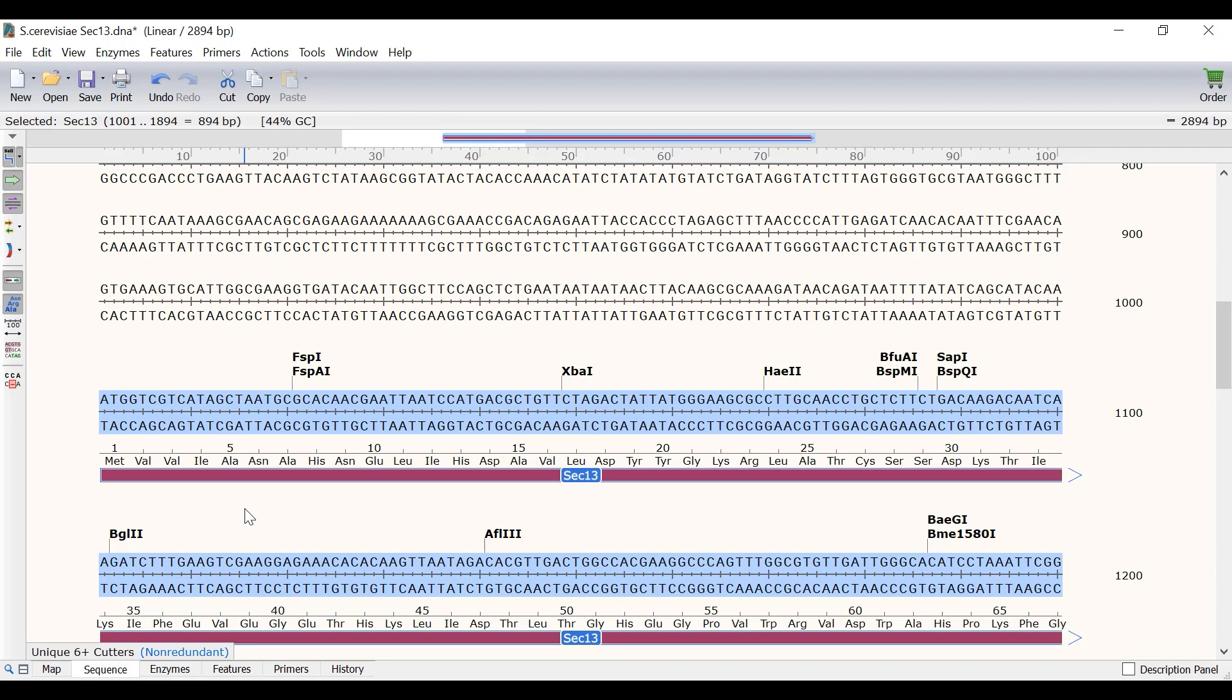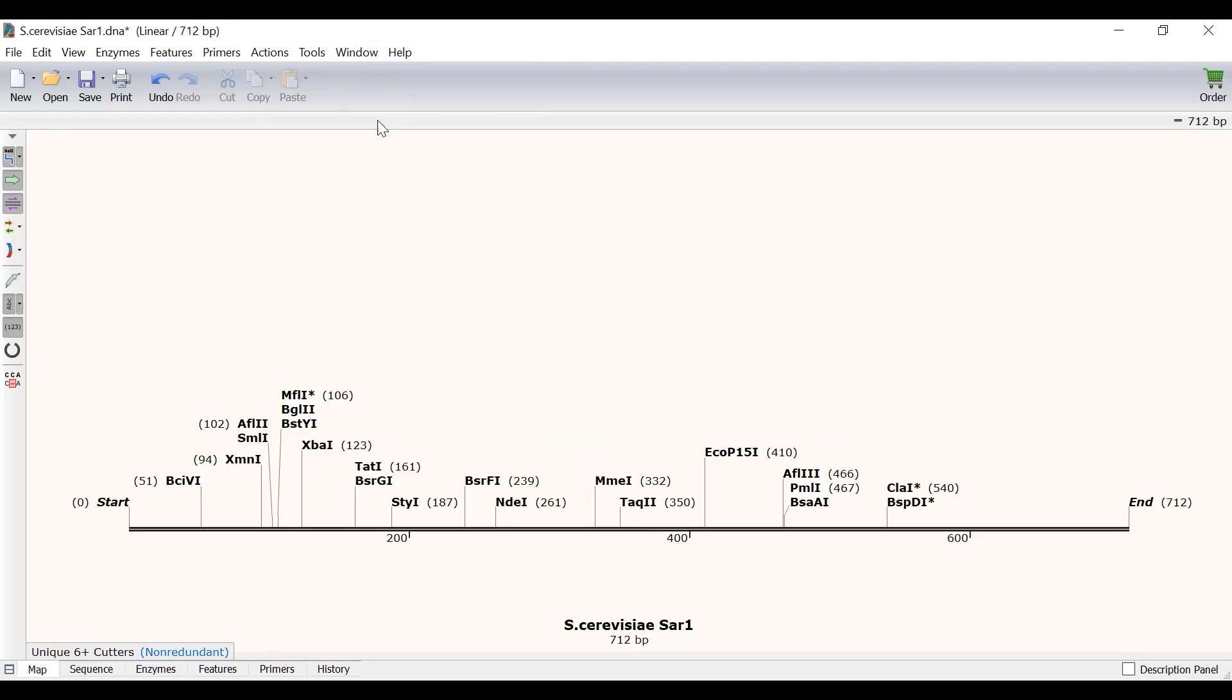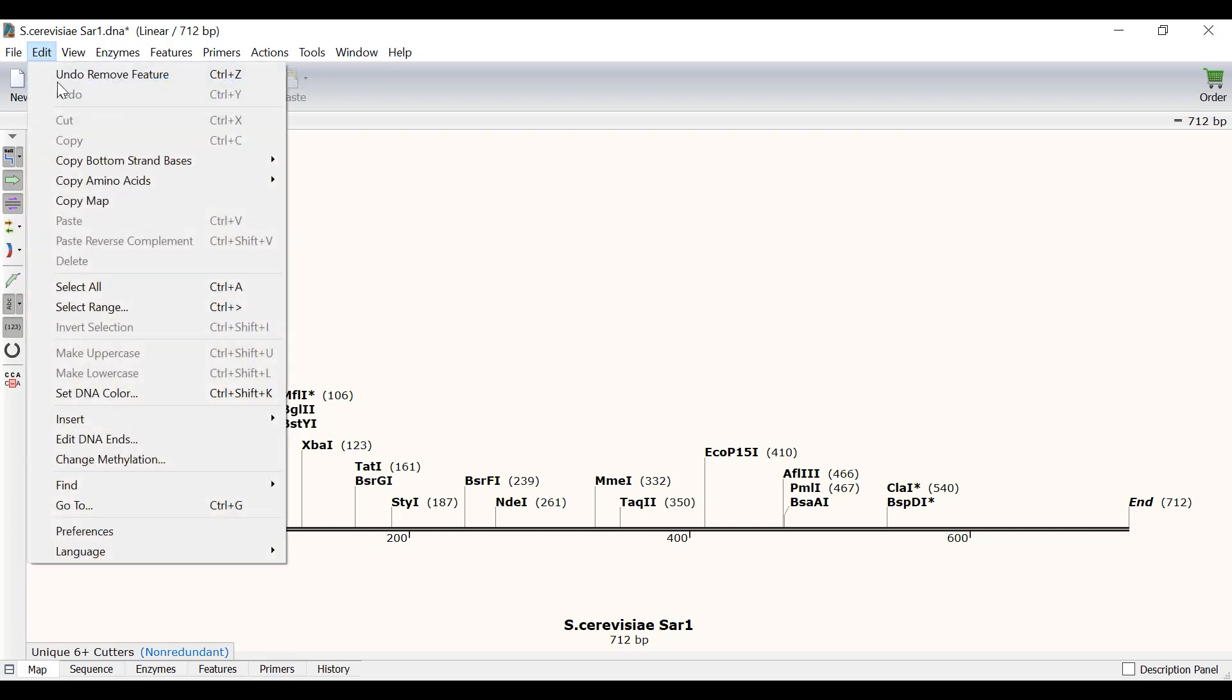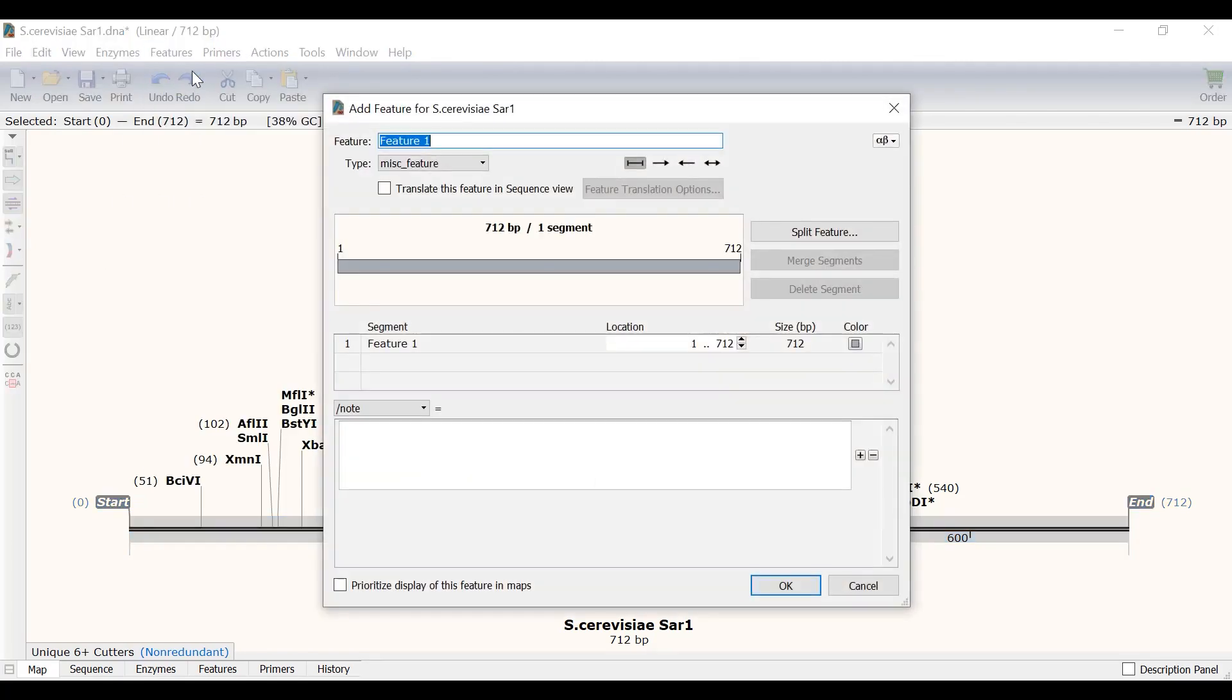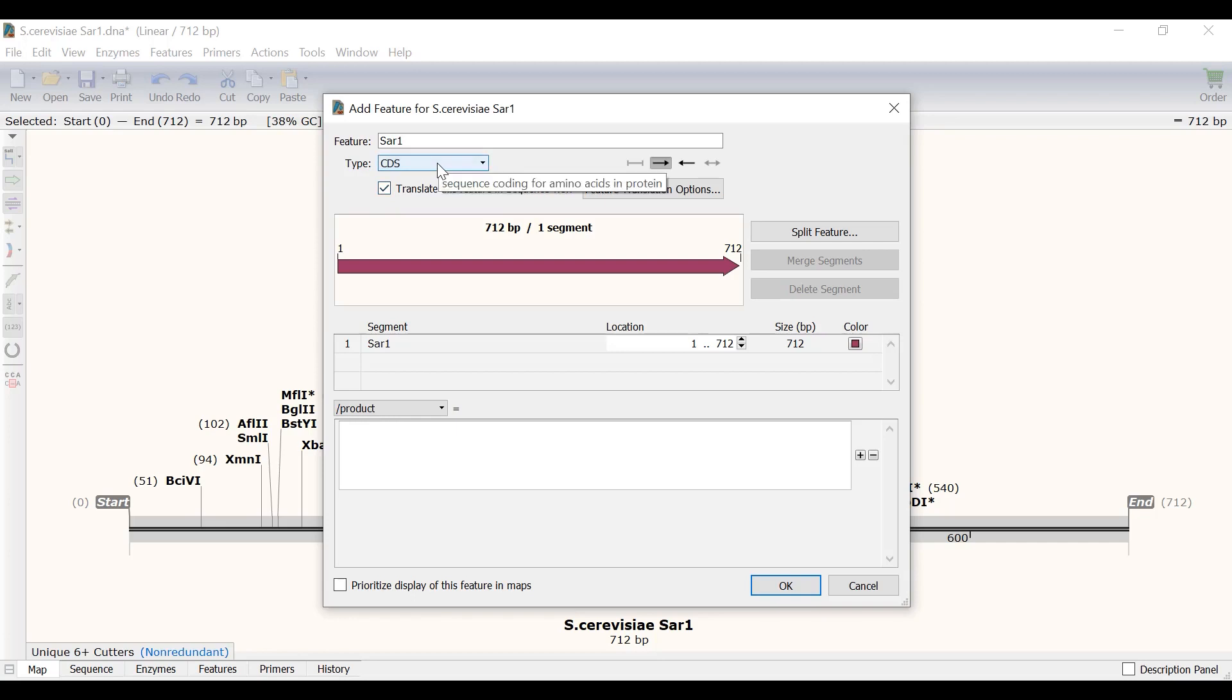But what about genes that contain introns? In another file I have the sequence for the Saccharomyces SAR1 open reading frame without any flanking sequence. I will firstly create a feature of this entire sequence. To do this I will select the whole sequence by going to edit, select all. As a shortcut you can press ctrl and a on your keyboard. Then I will go to features, add feature. I will call this feature SAR1 and I will select the option to translate this feature in sequence view. When I do this, notice Snapgene automatically classifies this sequence as a coding sequence or CDS. Finally I will click the ok button.